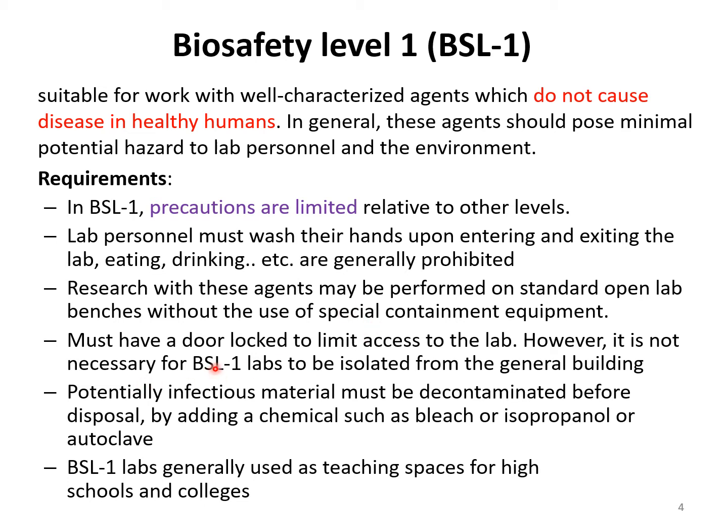Door locks to limit access to the lab are also needed, but not as much as at other levels. Potentially infectious material must be decontaminated before disposal. Of course, this applies to all levels. BSL-1 labs are generally used as teaching spaces for high school or college students. Once we talk about the other levels, these requirements carry over to the next levels also.